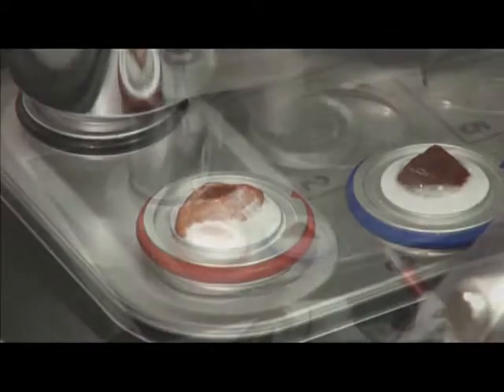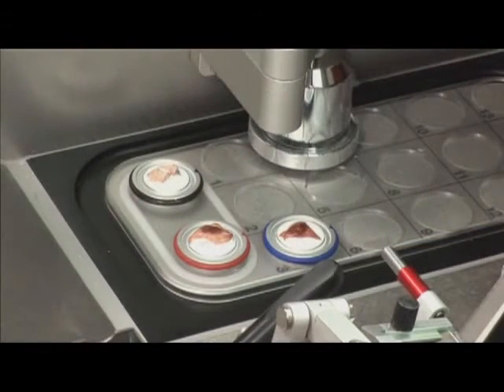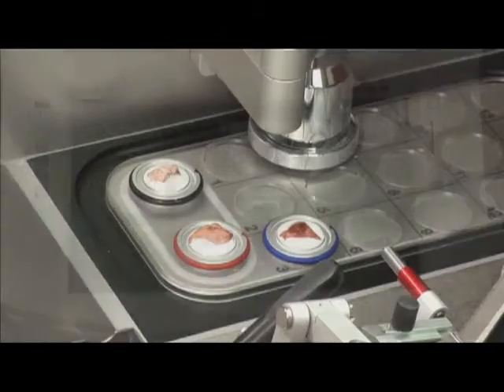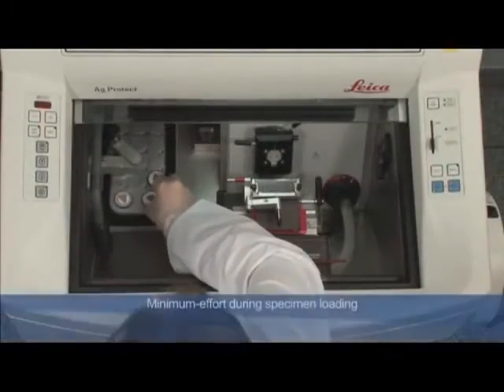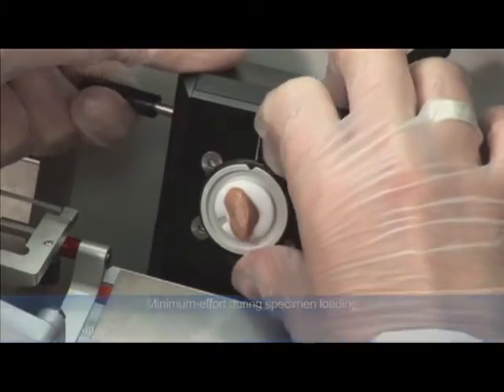The heat extractor enables heat to be extracted from the specimen from above while smoothing the surface at the same time. Only a minimum of effort is required to load the specimen into the new single-lever clamping system.